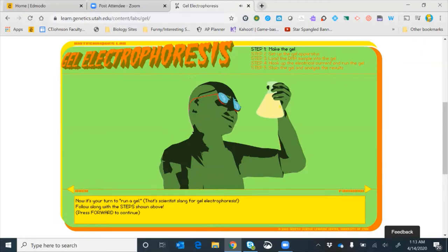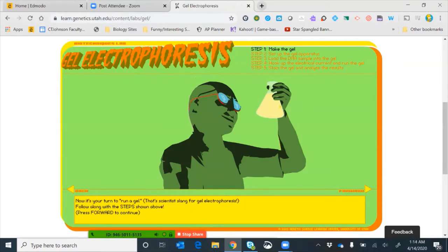Now it's time to make our gel. There are five steps: make the gel, set up the gel apparatus, load the DNA samples into the gel, hook up the electrical current and run the gel, then stain the gel and analyze the results. We would be doing this in the classroom, but this virtual lab does a pretty decent job of giving us that experience. Keep an eye on your handout and pause the video to fill in answers when needed.